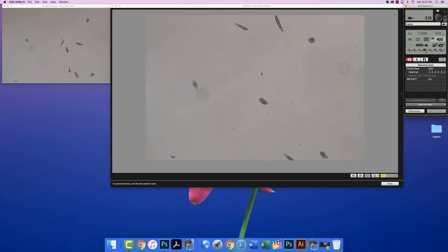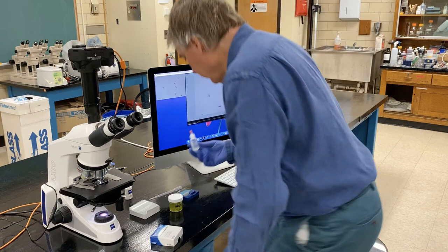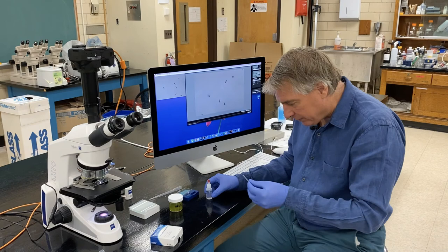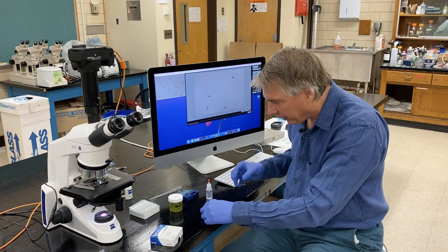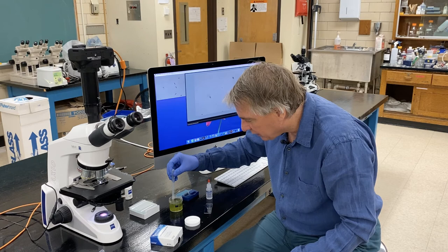Now, if these guys are moving too fast, you can buy some stuff called Protoslo, and I have some. Protoslo is also made by Carolina Biological, and as its name suggests, it slows down the protozoans. I don't know what's in it, but it's kind of like molasses. It's more viscous than water, so it's harder for protozoans like Euglena, which move really fast in water, to move in the Protoslo.